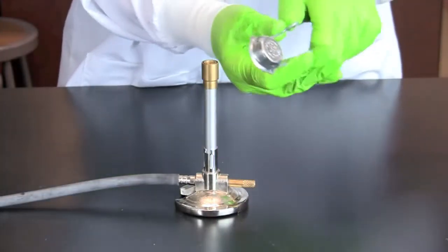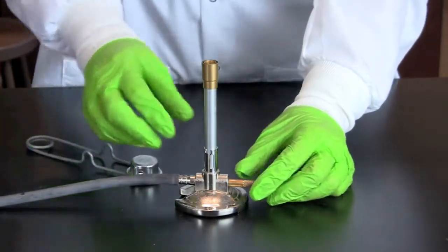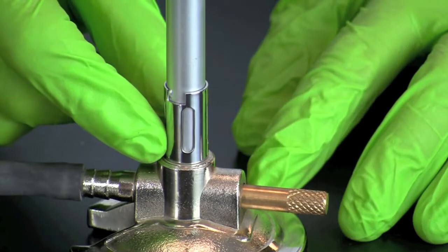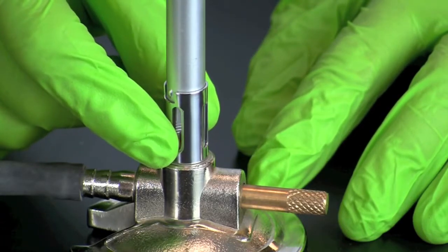Once you hear the gas, ignite the burner and set the height of the flame by adjusting the amount of gas. The temperature of the flame can be adjusted by rotating the collar to control the flow of oxygen.